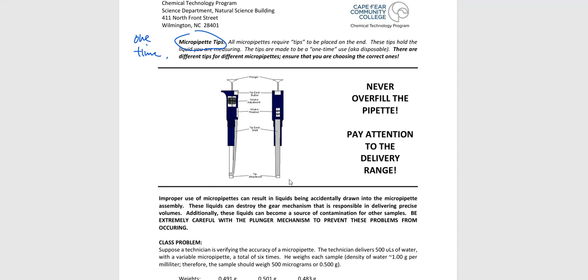And you can autoclave them, and they can be sterilized. So biotechnology, microbiology, they might have a need for these, but they need to be super clean. They need to be sterilized. We need to make sure that they stay that way. They are made of a heavy type of plastic, if you want to think of it that way. They are autoclavable, they can be sterilized, but again, they are meant for one-time use. Once you use them once, trash them, get rid of them, make me happy.